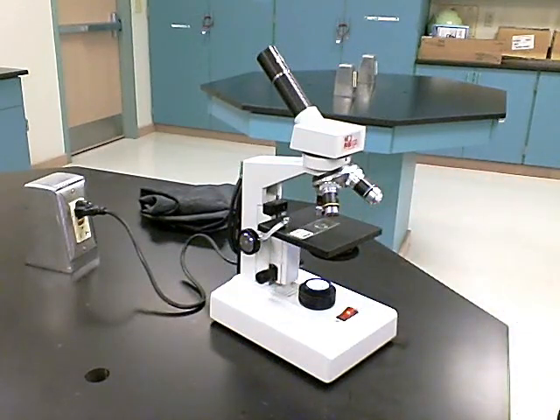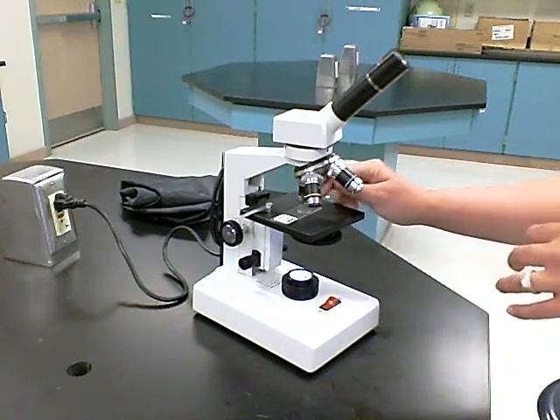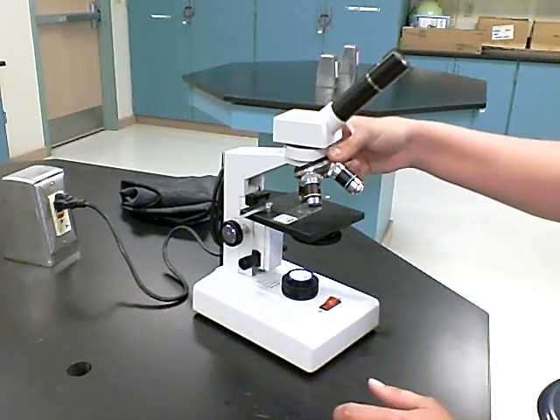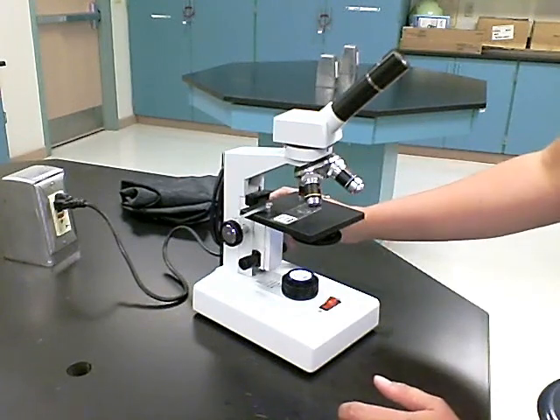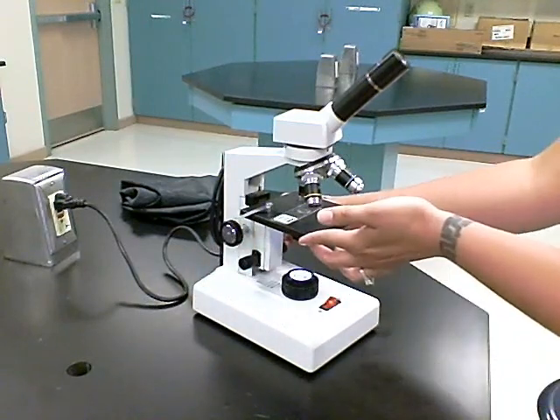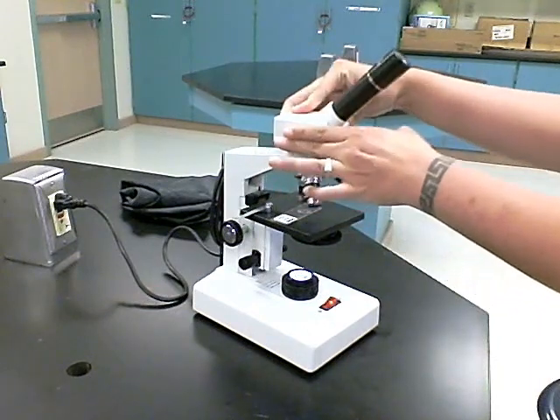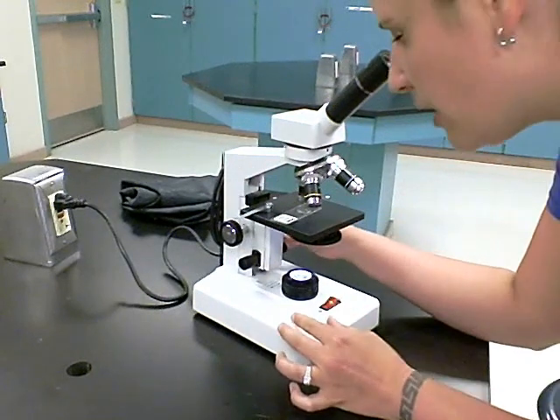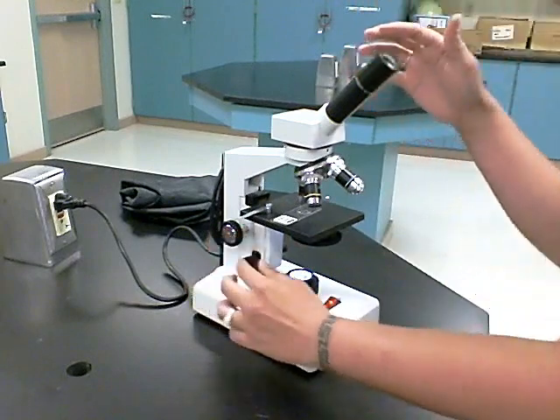Okay, when you're ready to bring your slide into focus, you have it on the stage, right directly in the middle of the light. You always want to start with your lowest objective, which in this case is 4x. So you'll see I have the 4x objective in position. And then when you begin, you want to use the coarse knob. You'll see the stage is in the highest position on the lowest objective. Using the coarse knob and looking through the ocular, which will turn, you want to turn it to face yourself. Looking through the ocular, you use the coarse knob and move the stage down until you see it in focus.